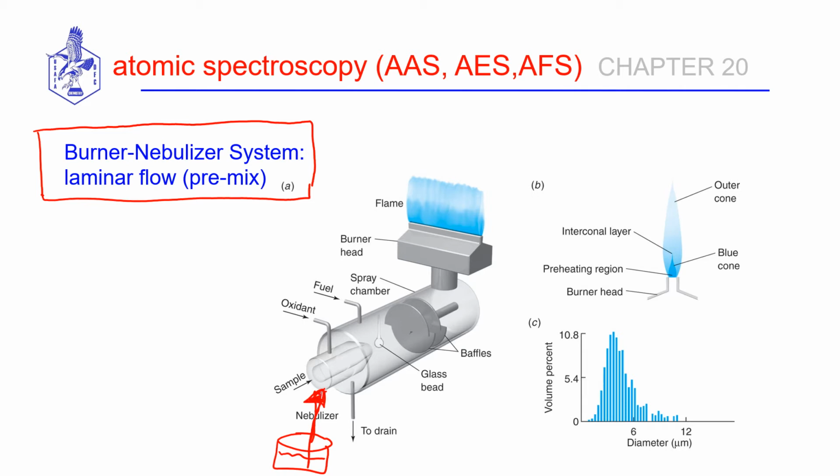Using the nebulizer, it's what's known as the Venturi effect. A pressure drop sucks the sample up. Our sample gets drawn up and hits this glass bead. That causes it to form a mist, a bunch of little tiny droplets in which we have just small amounts of solvent.